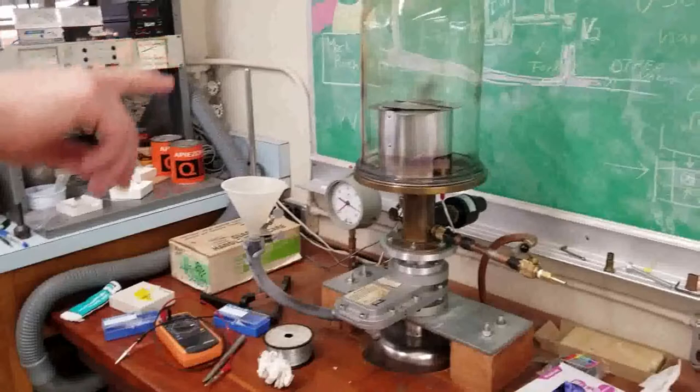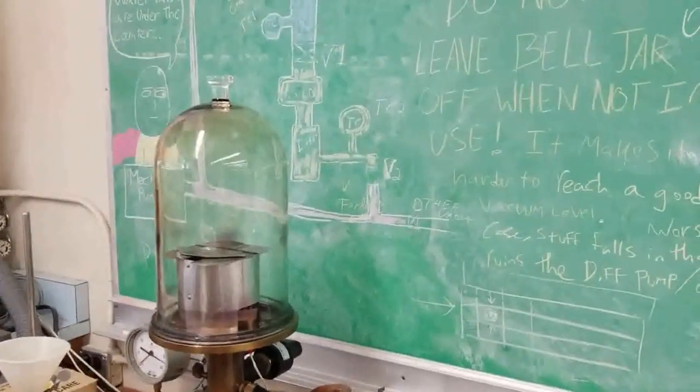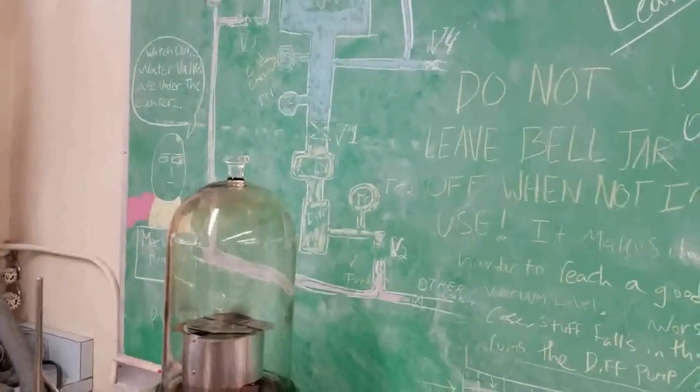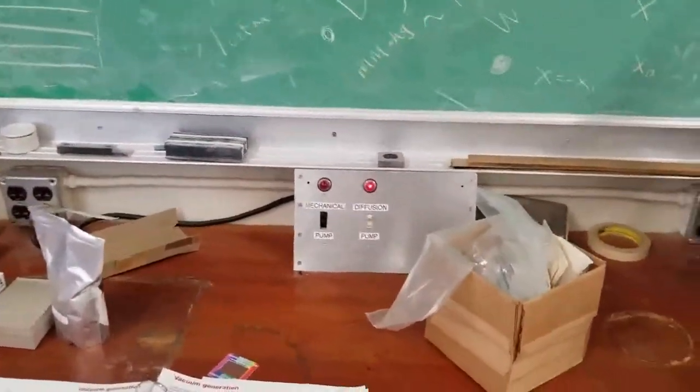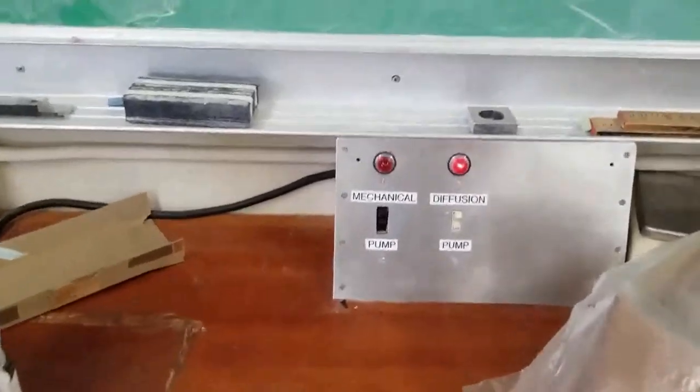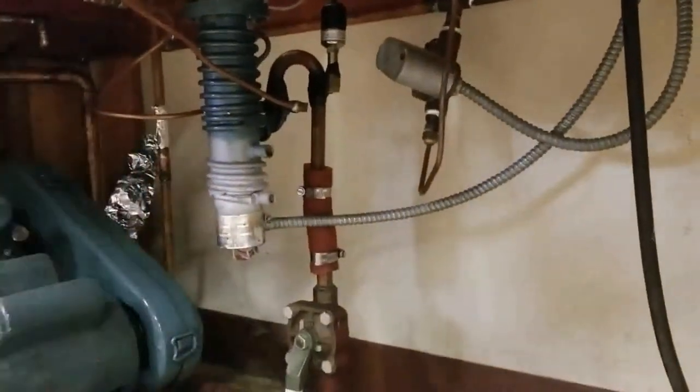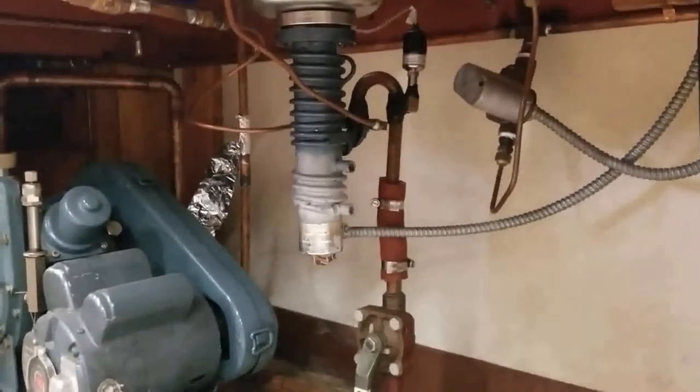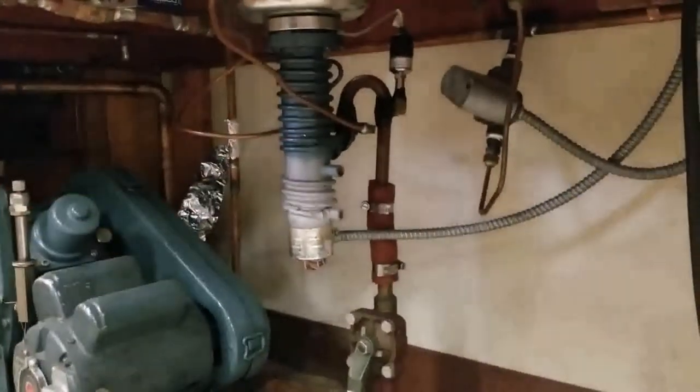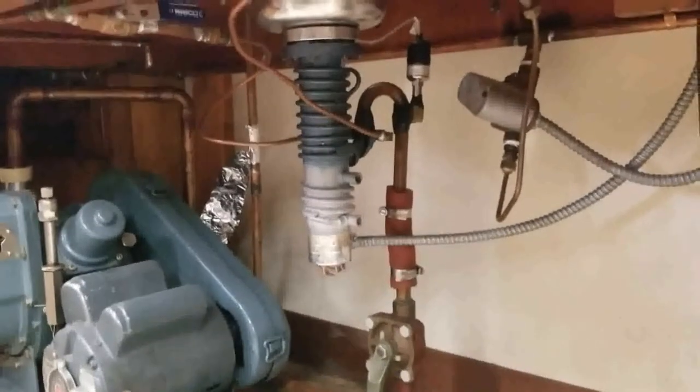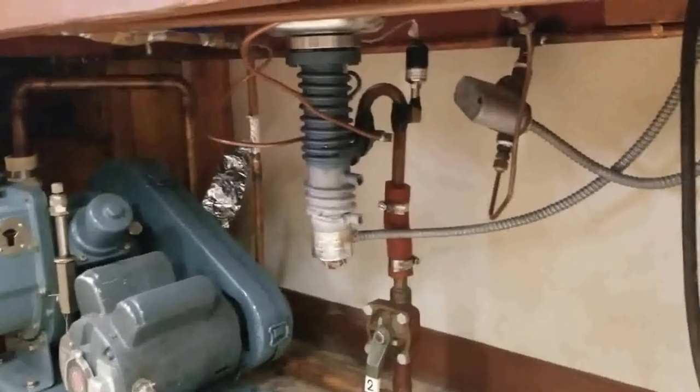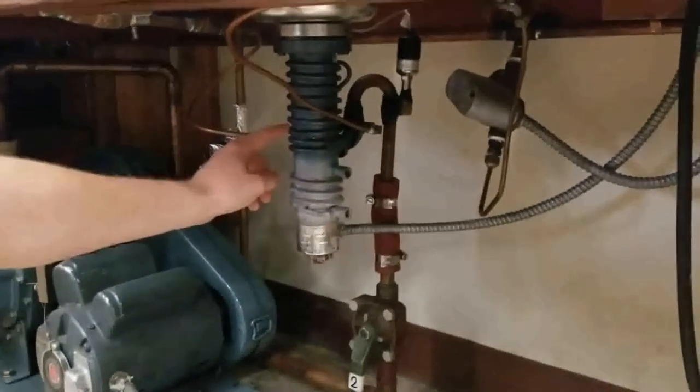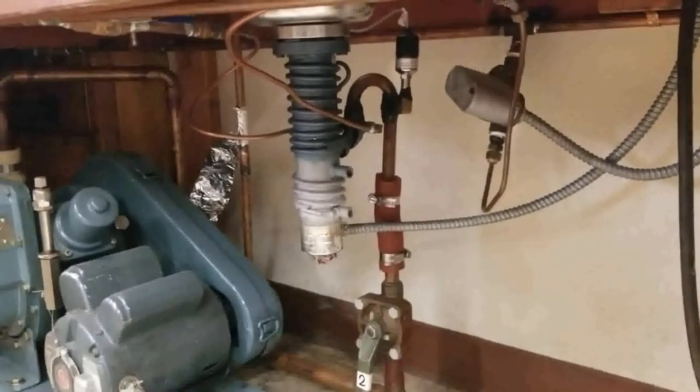But we haven't even turned on the diffusion pump yet. So it's actually kind of crazy that we're already down to 10. Yeah, that's just the rough end. Okay, so let's see. Valve two open, valve one open, valve four closed, valve three closed. So I think we're good to go. We can turn on the diffusion pump. Let's turn this guy on. All it's going to do is it's just going to heat up. It doesn't have any pumping action. And you can check if it's hot just by putting your hand here. You'll be able to feel it when it gets hot. But don't, it gets super hot. So you probably don't want to touch it if it's really hot. But it's got the coolant line there. Is the water running through that right now? Oh yeah, the water is running through it right now. Oh, so even if the water is running through it still gets hot. It still gets really hot because it just needs to, this whole thing is at the boiling point of the oil. And this is just making it a little bit lower so the oil will condense onto the sides.